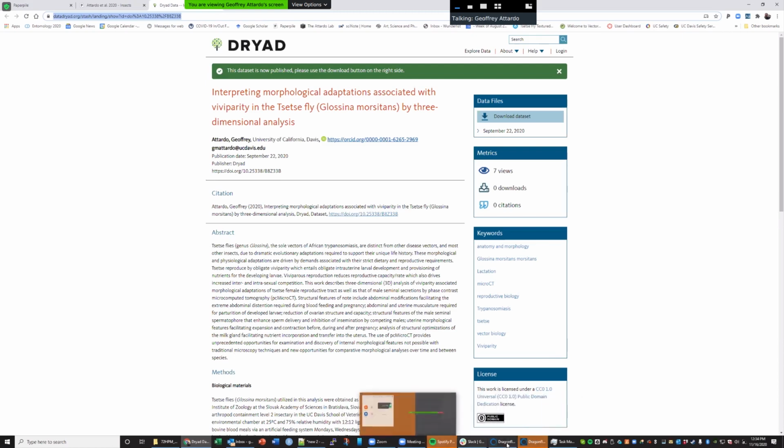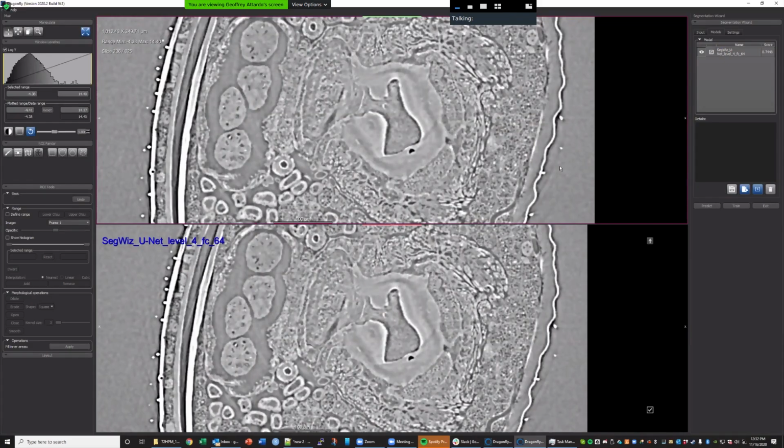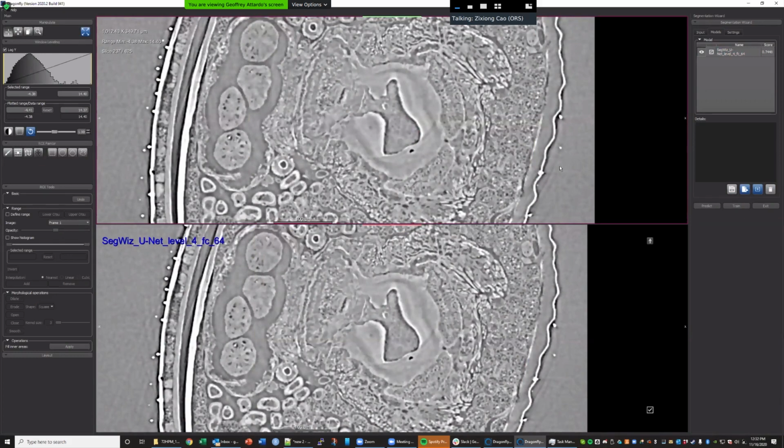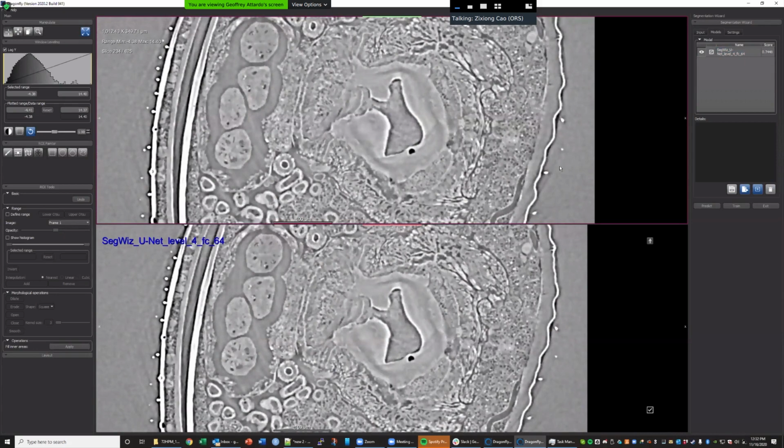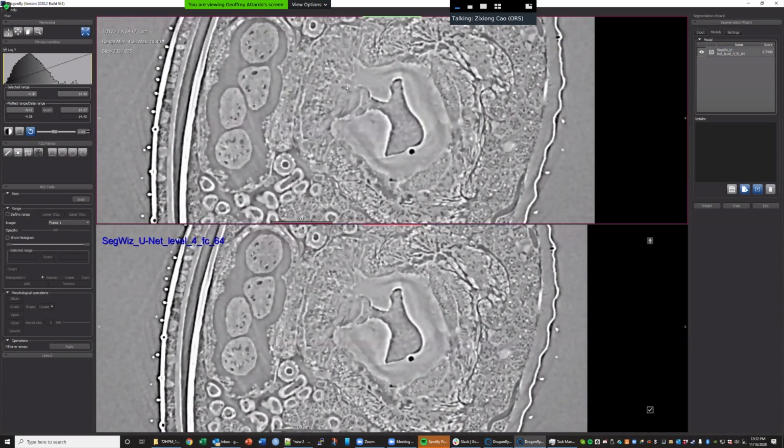Should I just put it in the Zoom chat? Yeah, you could do that. Put it in the chat. I will save it. Okay. Yeah, because maybe there's something strange about this data set that is throwing off the... Right, I will test it on my computer to train a few models to see which one might work. And if not, I will talk with our developers.